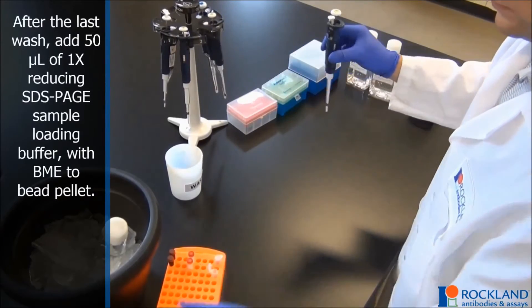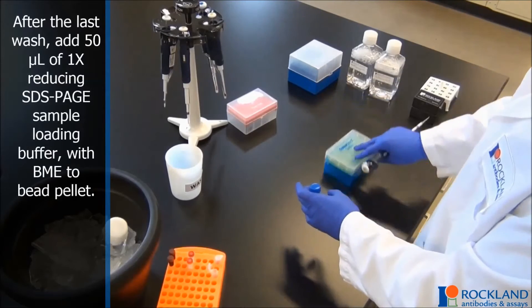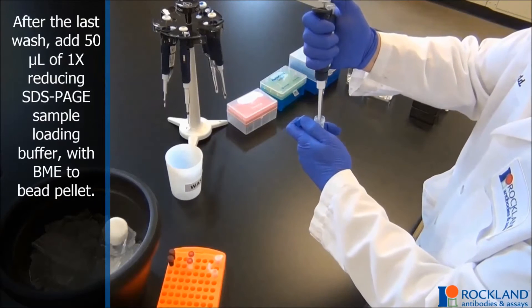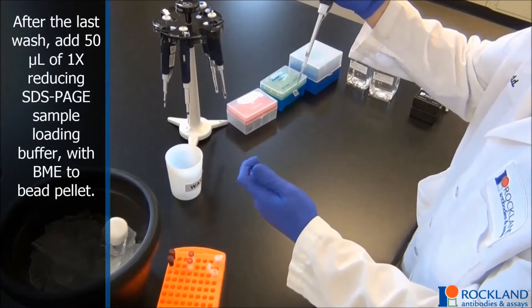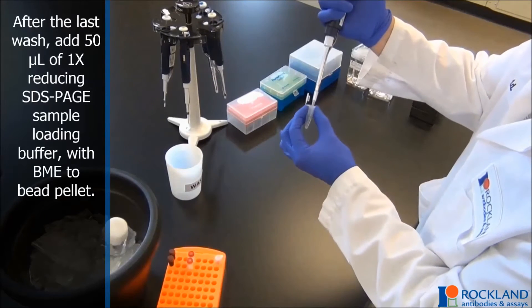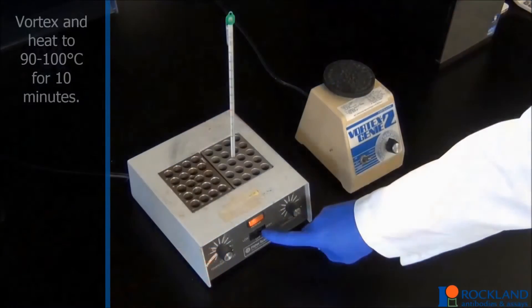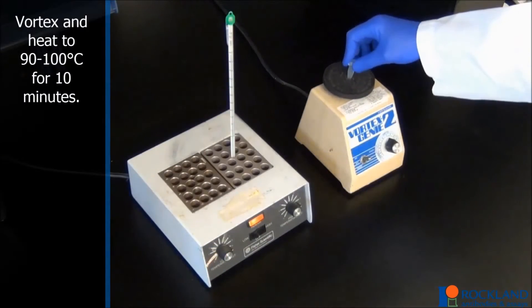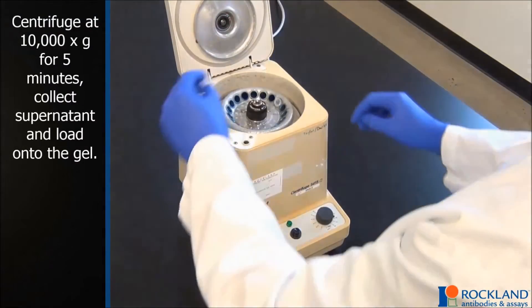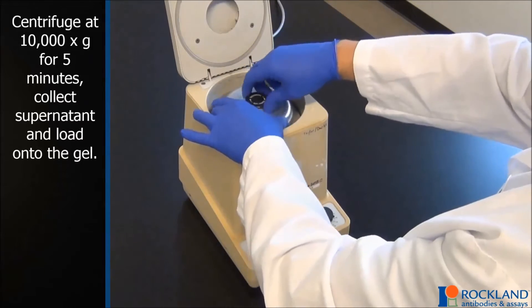After the last wash, add 50 microliters of 1x reducing SDS-PAGE sample loading buffer with beta-mercaptoethanol, dithiothreitol, or equivalent reducing agent to pellet. Vortex and heat to 90 to 100 degrees Celsius for 10 minutes. Centrifuge at 10,000 g for 5 minutes. Collect supernatant and load onto the gel.